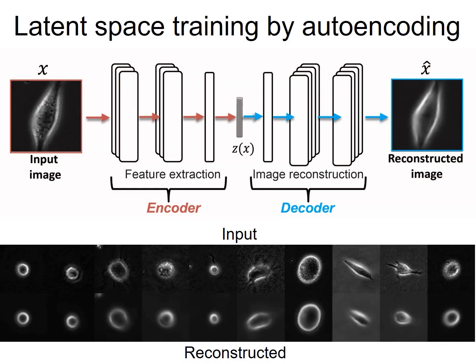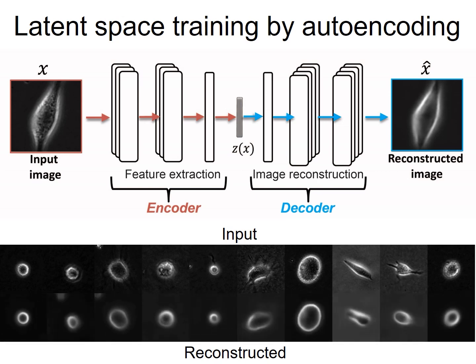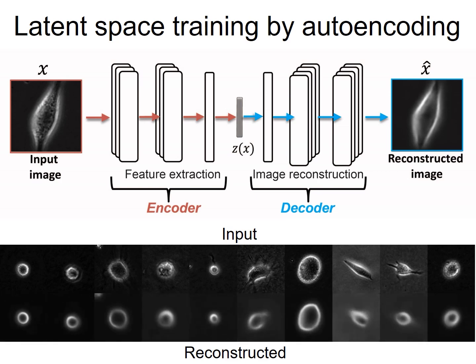First, we trained a generative deep network to encode compressed representations of single melanoma cell appearances. The network was trained to minimize the discrepancy between input and reconstructed images, entirely independent of any specific classification task.